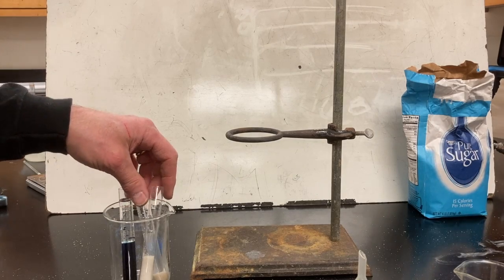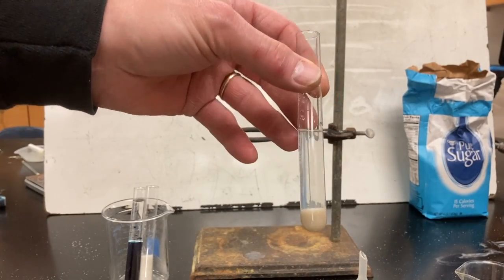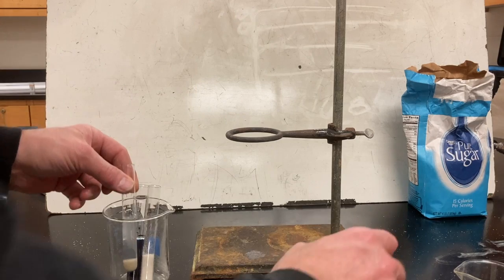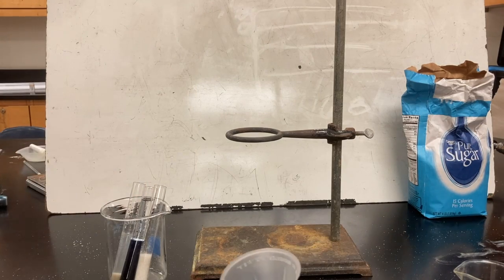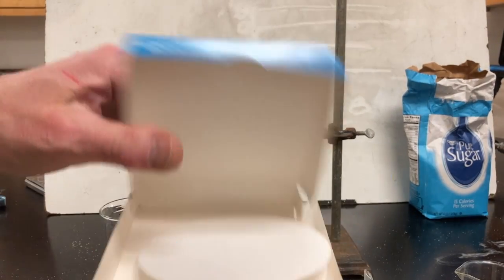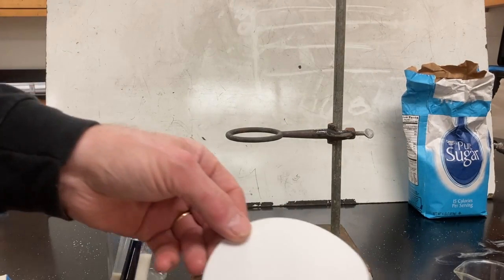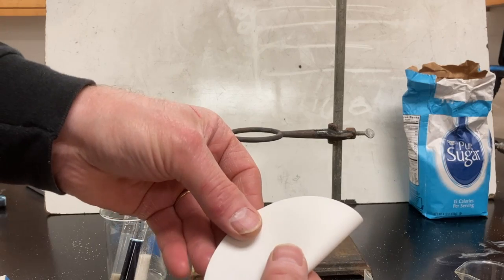Here I'm going to separate a mixture. It's the mixture of water and sand that we created. The tools I'm going to use, I have a plastic funnel and I have some filter papers, which are just pieces of paper, kind of like a coffee filter.